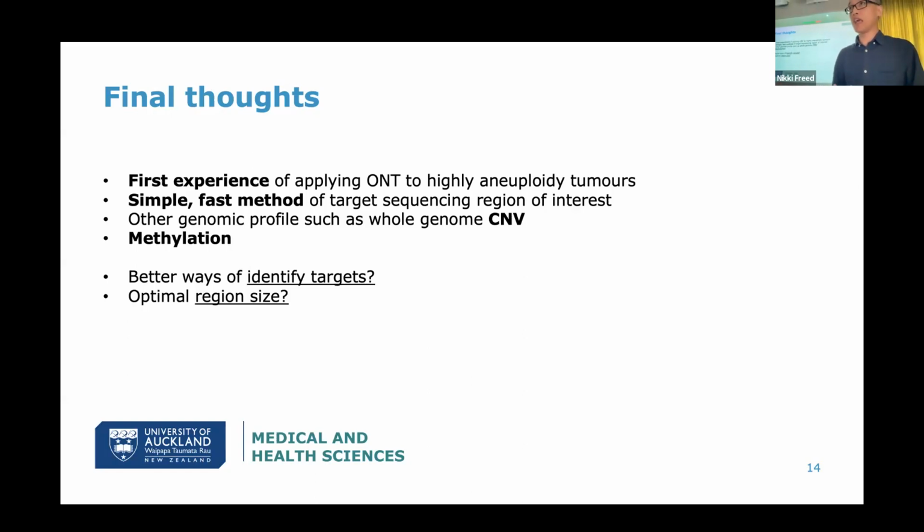Not to forget that methylation is another big thing that we can get with nanopore. There's a lot of tissue of origin analysis you can do based on nanopore methylation patterns, which is something that we are looking to do.